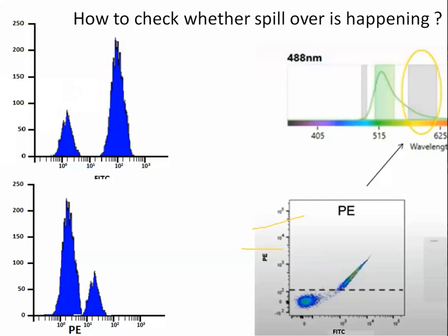But if you find in the PE channel also there is a signal, is this correct? It should not come, right? Because I have stained the cells only with FITC, how can a signal come in PE? This is wrong. So the FITC fluorescence is getting spilled over into PE. This is how we need to check whether spillover is happening.